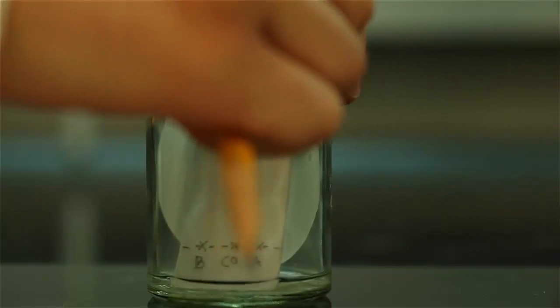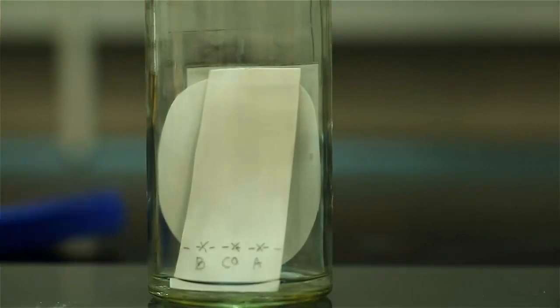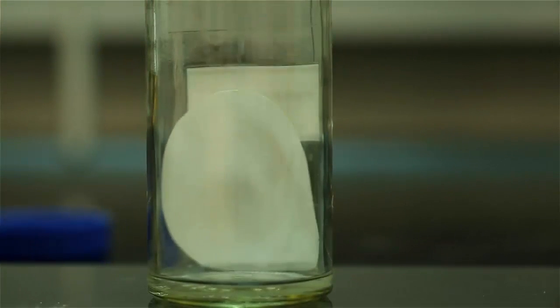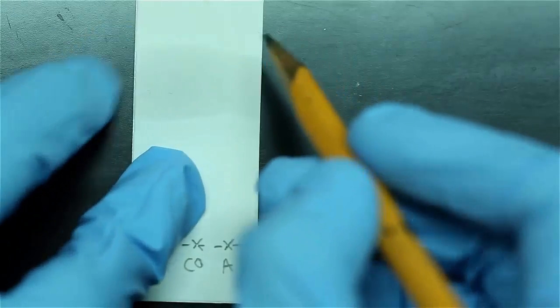Quickly remove the plate from the jar when the solvent reached approximately 1 cm from the top. Be sure to mark a dotted line where the solvent reached before it evaporates.